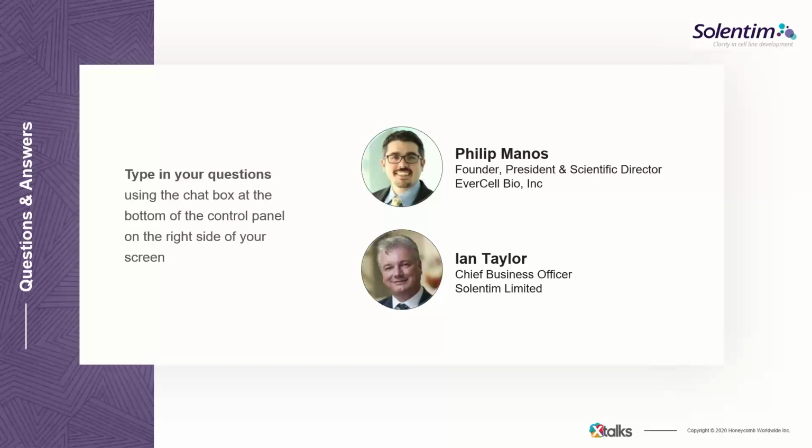The last part that's important to optimize, which is really more about induced pluripotent stem cell biology, is, as with all the other applications, the quality of the cells that you're using and loading into the VIPS system itself. Thank you, Phil.